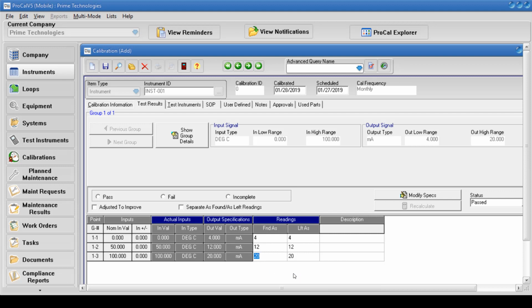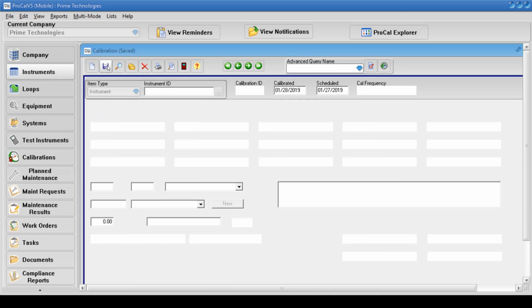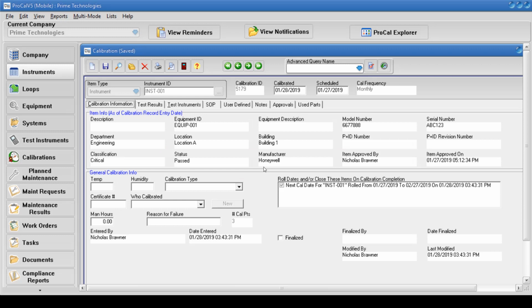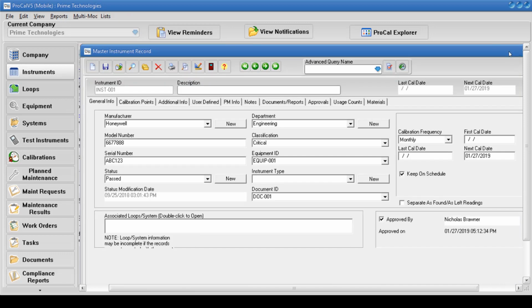You can add and modify all types of list records except for modification reasons, approval policies, and responsible technicians. However, you will not be able to delete any of these records. You can run all of the reports and reset the report directory, but you will not be able to access the report maintenance screen. You will not be able to add, modify, or delete work order or plan maintenance records. You do not have access to the system options, user administration, or user group screens.